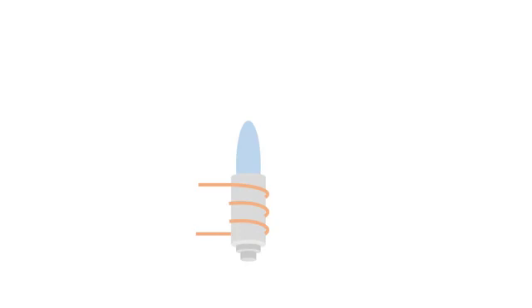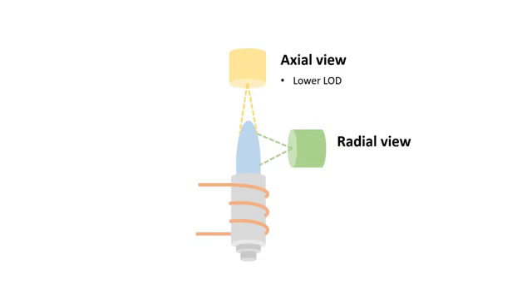Typically, modern ICP instruments offer 2 different viewing geometries for the measurements of atomic emission: the axial view and the radial view. The axial view offers a lower detection limit, while the radial view has better stability and higher precision. So which one shall we use? In this experiment, we'll be using the axial viewing geometry, since we are interested in trace analysis of heavy metals in water samples. A lower detection limit may be more suitable for our case. If we are dealing with samples with higher TDS concentration, a radial viewing geometry may be selected.